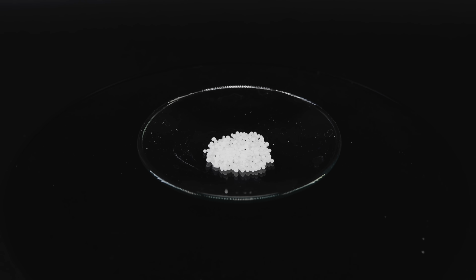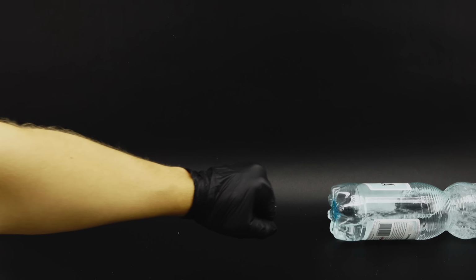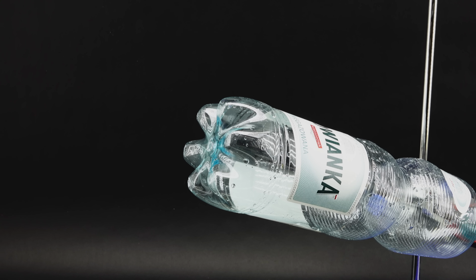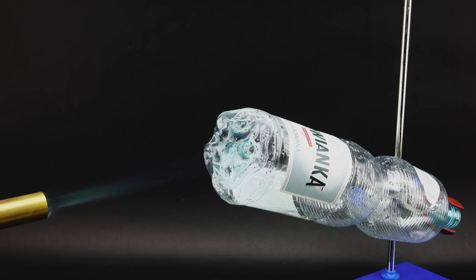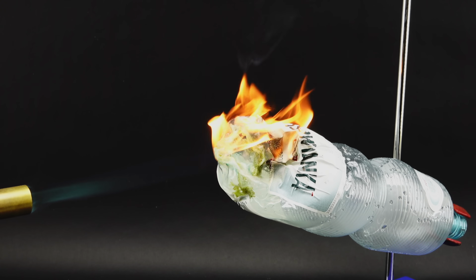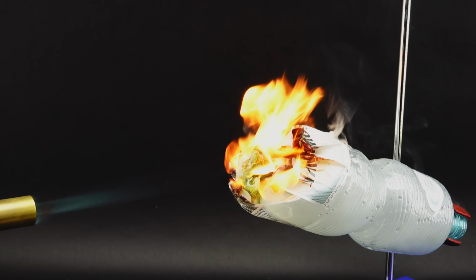To do that, however, it needs really high temperatures, which means that I can't really use water as the solvent for this reaction. I also can't do this reaction without any solvent, since heating the plastic too strongly would just burn it, and this means that I have to find something that's accessible and has a high boiling point.